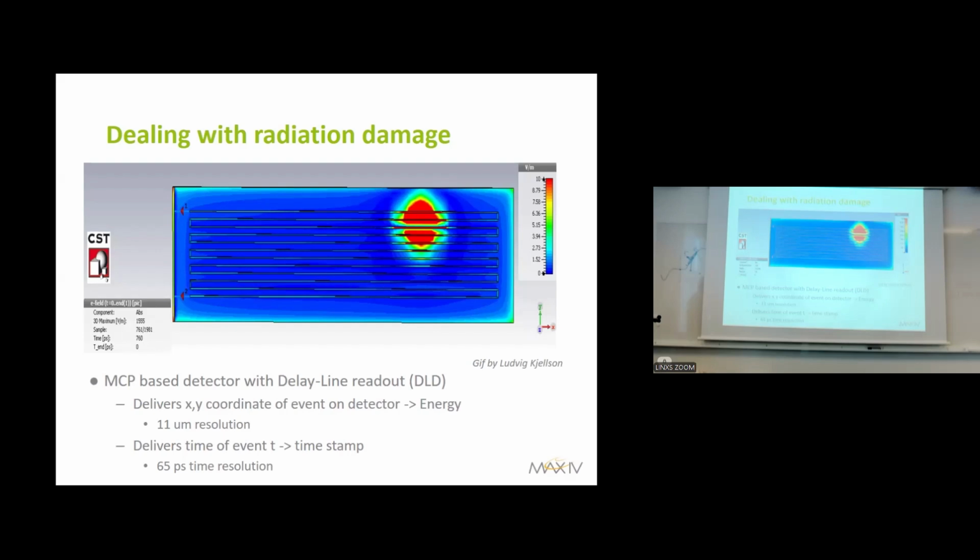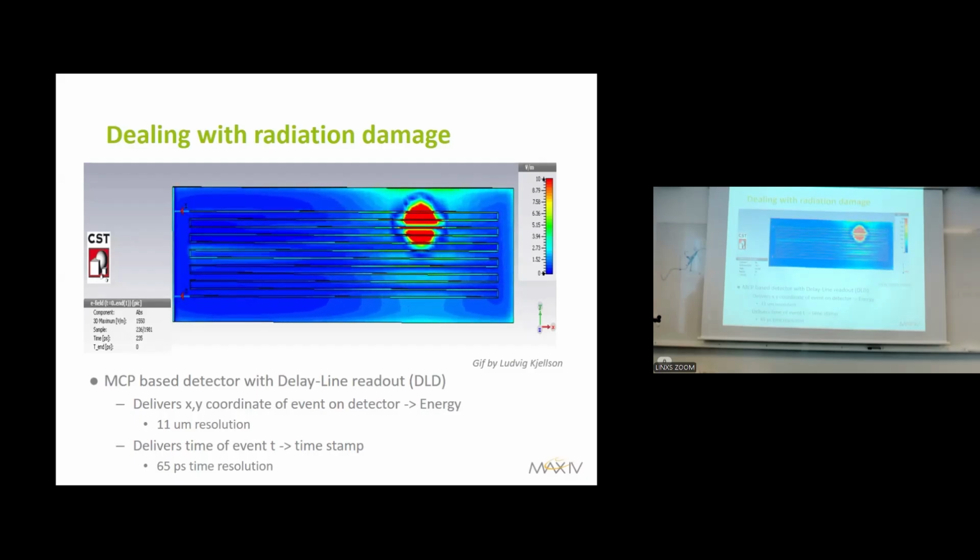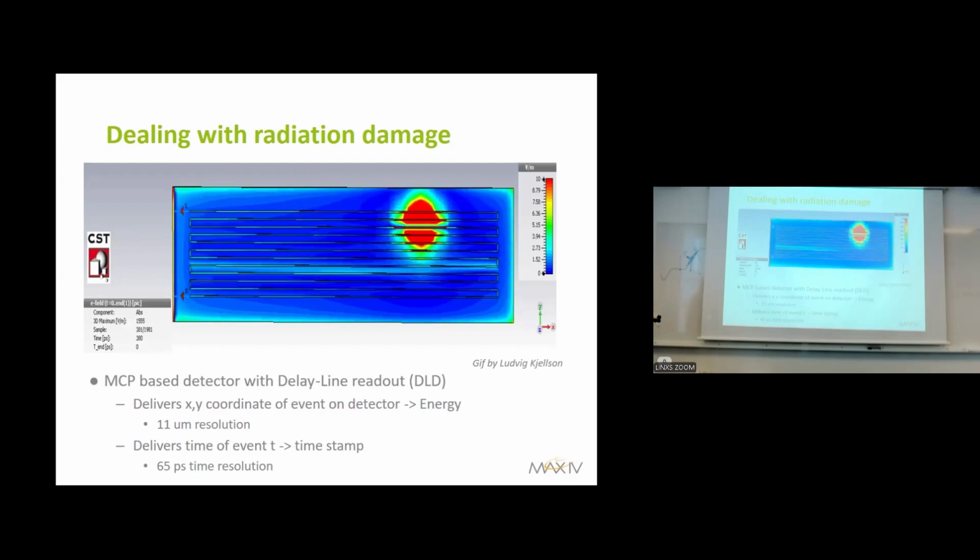That part we use mostly for just signal to noise help. I'll show you how. And then we also added another timestamp that gives us microseconds and onwards. So this means that because we record every spectrum when it arrived, every photon when it arrived, we can always go back and look at changes in the spectrum, cut different slices of the measurement and look at them individually, compare the beginning to the end, and all of these things that I'm sure you'll see in the practical. To figure out if we have sample damage ongoing, or do we have drifts of the energy and all of these things. It's important.